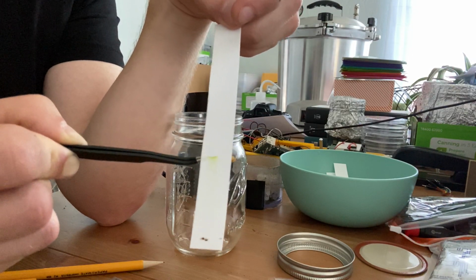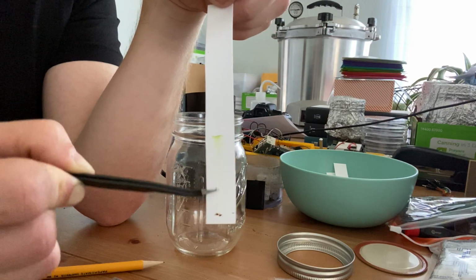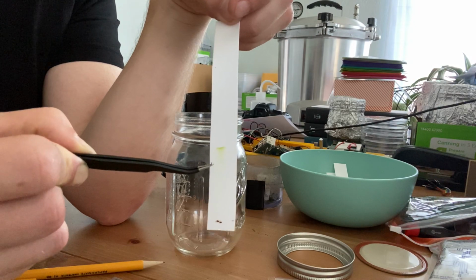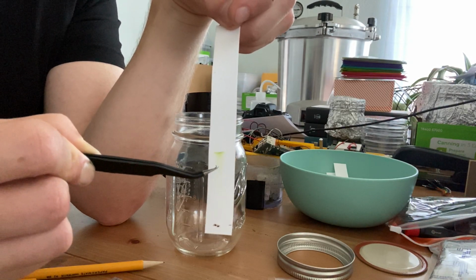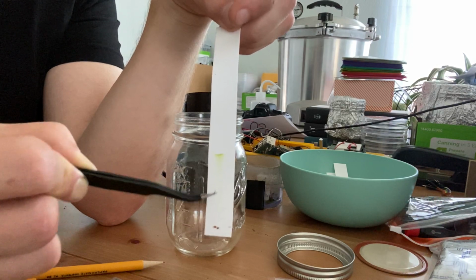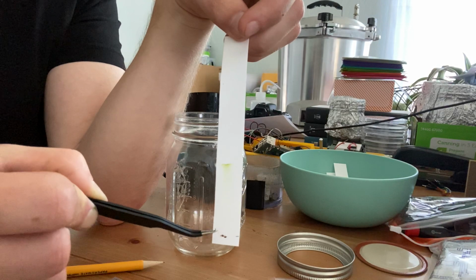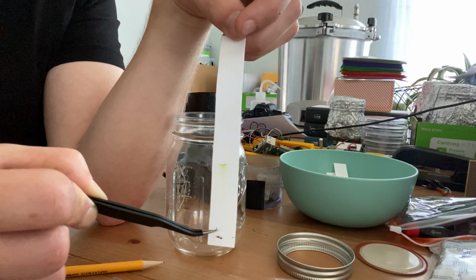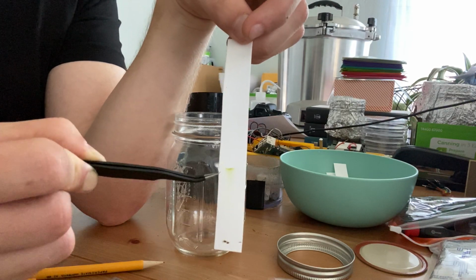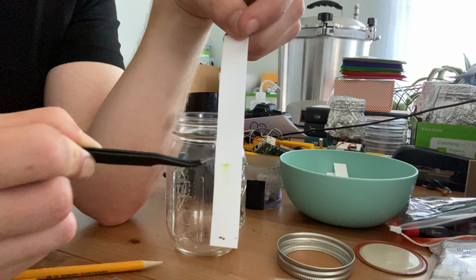So this is an interesting way that you can take a compound and separate all of its constituent components, and with other compounds and more purified techniques, there will be more differentiation between them. There might be a dot here, there might be a dot here, but you can use this to determine what compounds make up your subject down here, which has a word for it: analyte. This is called your analyte. You can look at the different compounds that make up that analyte, and so I think that's pretty cool.